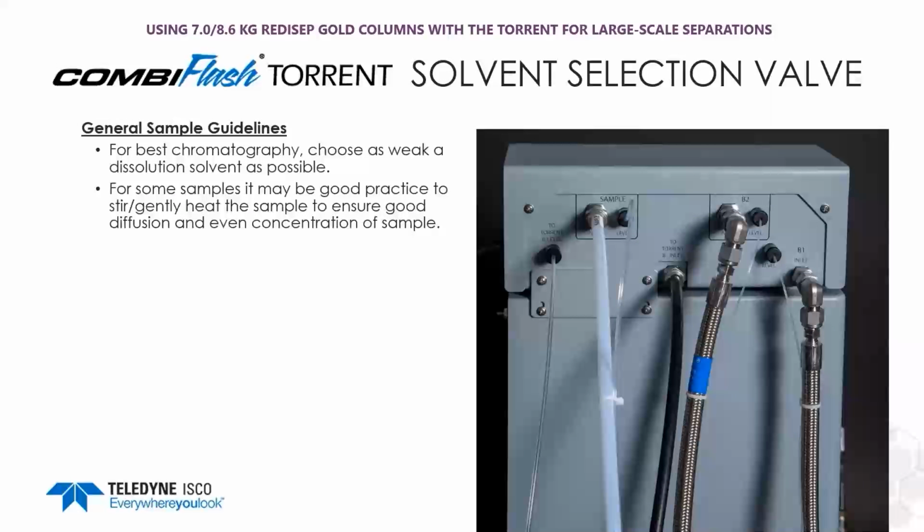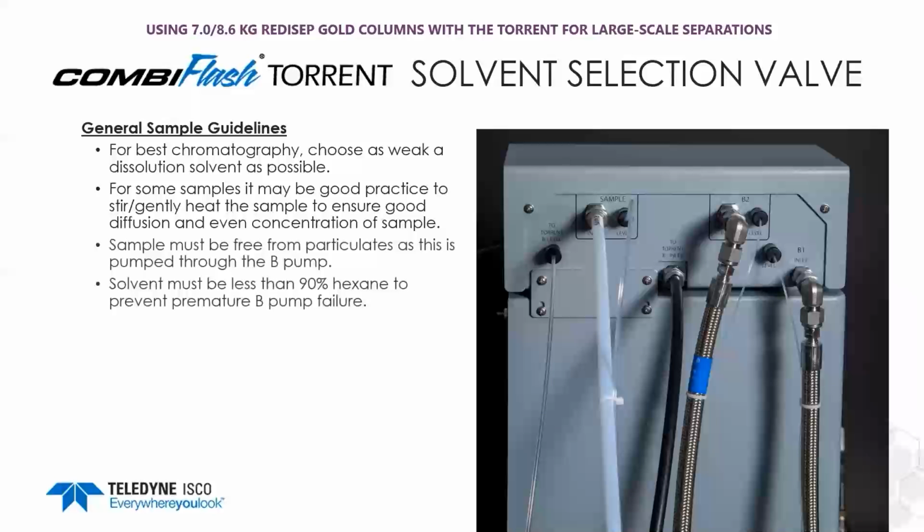Some general guidelines for this. For best chromatography, you would want to choose as weak a dissolution solvent as possible, as we discussed before. For some samples, it may be a good practice to stir or gently heat the sample to ensure that you have good diffusion and an even concentration of the sample throughout.